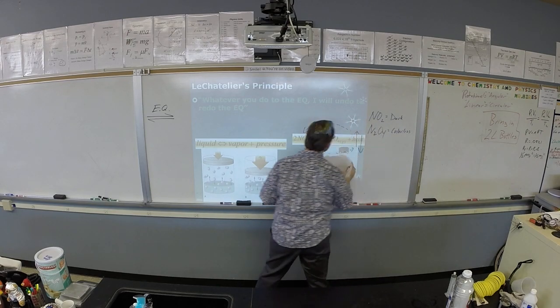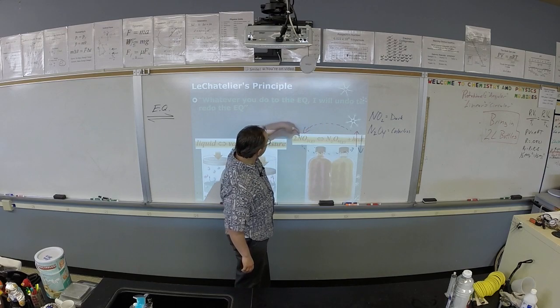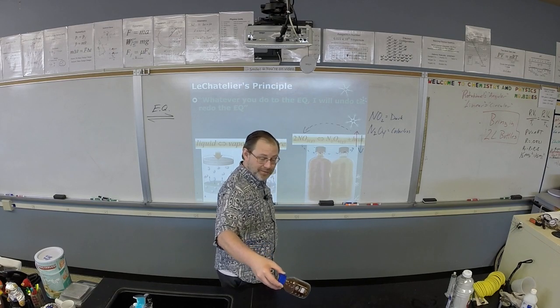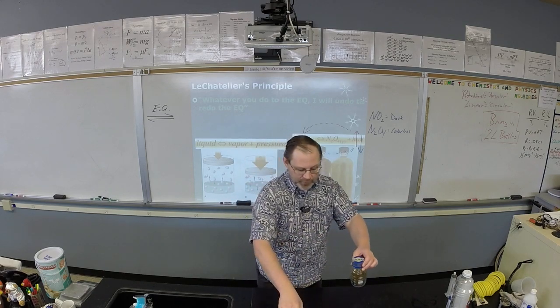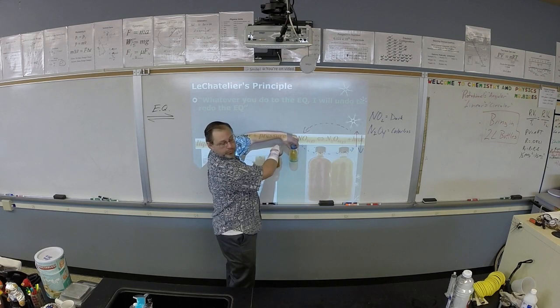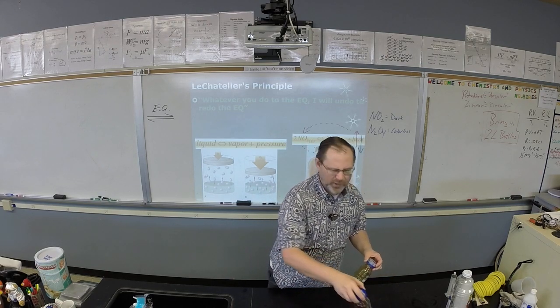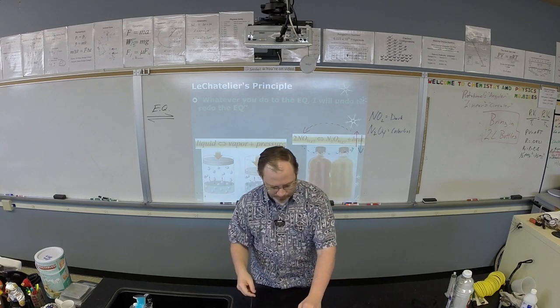So when you heated it up, the stress was too much heat. So you shifted the equilibrium towards the NO2 side. This one has more NO2 because it's hot. This one has more N2O4 because it's cold. Hot, cold. You can switch them too, and they'll go back to each other. Water's not hot enough. Do I need to switch them, or does that confuse you? Switch them. Okay. I want to see what will happen.